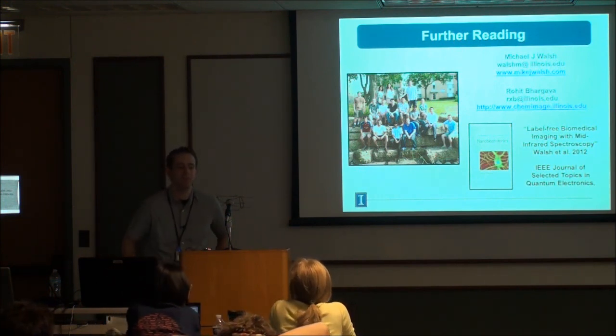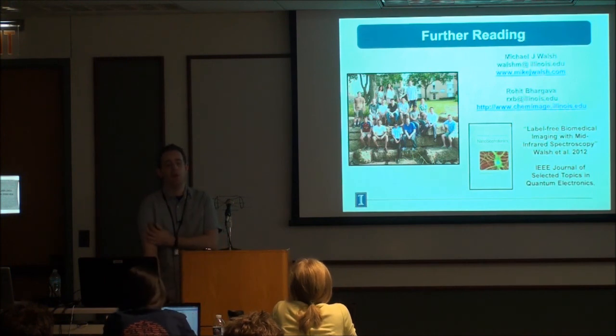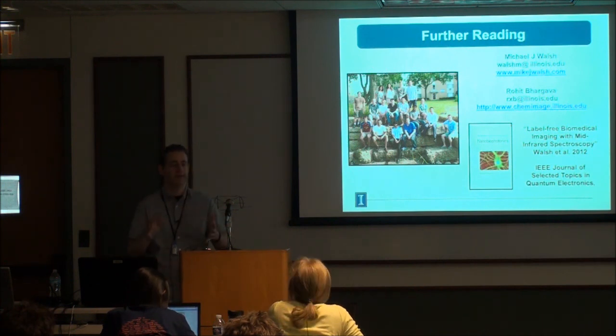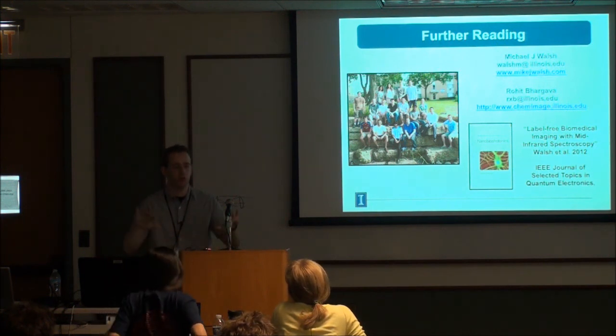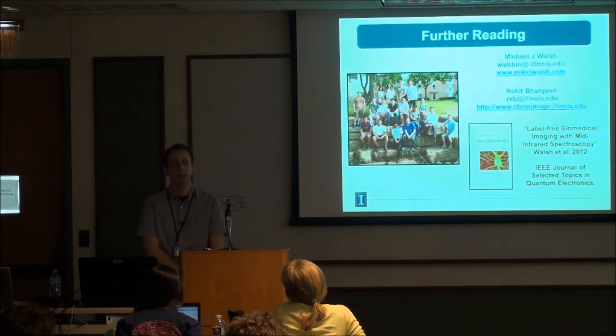What sample area can you scan using ATR? With ATR, it's 500 by 500 microns. Typically, only 400 by 400 is useful. As you get towards the edge of the crystal, you tend to get basic crystal artifacts. There is now a new 1mm by 1mm ATR crystal on the market. That came out a few weeks ago. I haven't tried that yet.